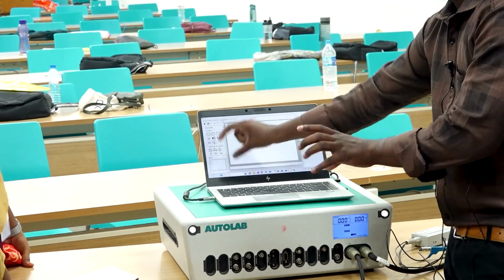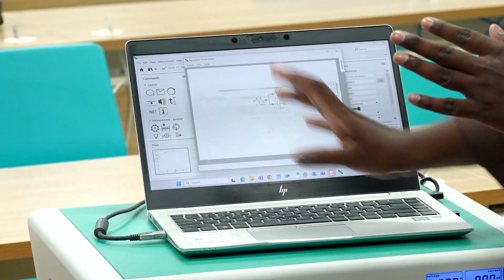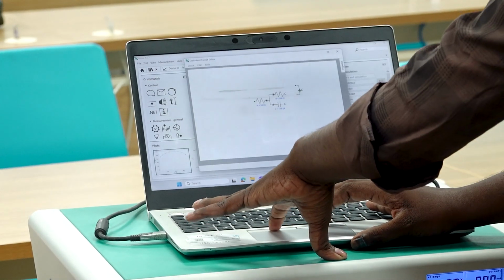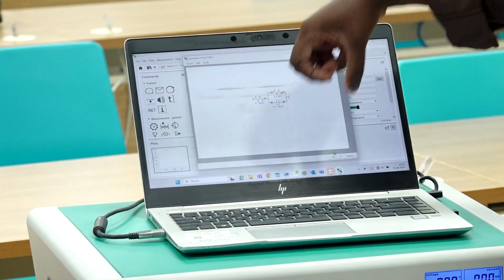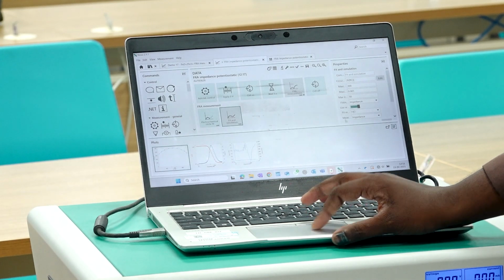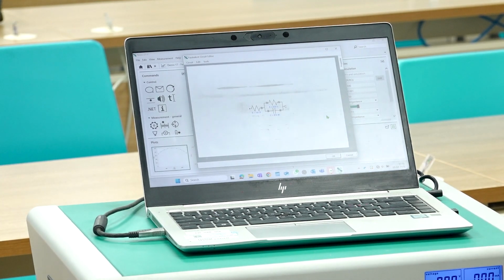So in this graph, that's it. Internal resistance, charge transfer, double layer. Okay. So I am going to close the circuit. So add connection, parallel join. Okay. I just closed. So these are the default values. Once you click OK, it will get the actual value from the graph. So first let me give OK. Then if you go there, you can see internal resistance, charge transfer and capacitor. So this is how you need to create a circuit.